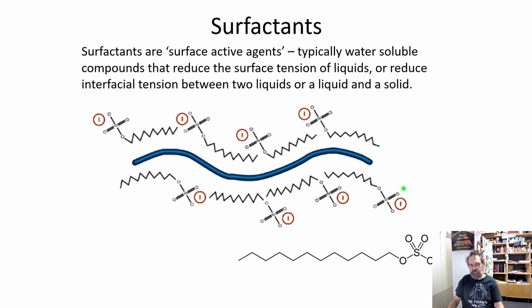What these do is that the SDS molecules, you end up linearizing the protein either by boiling it or just having it in solution, and the hydrophobic tail region interacts with the hydrophobic regions of the protein and starts coating the molecule. As they do, they open up the structure of the protein molecule so that you can get more and more of these SDS molecules associating. And then you've got these negatively charged groups that are now interacting with water that surrounds this protein surfactant complex and allows that to be suspended in water.